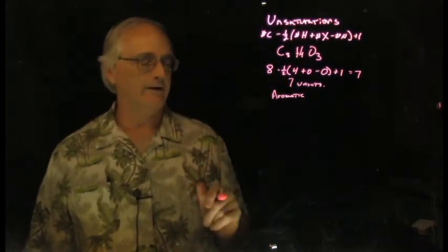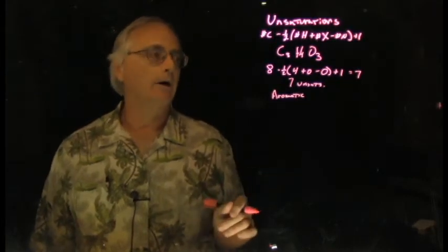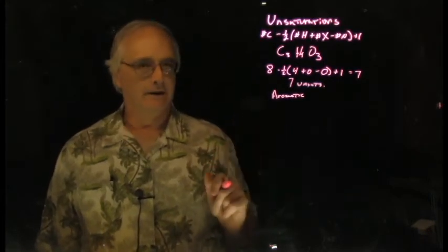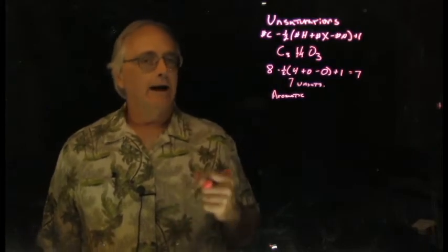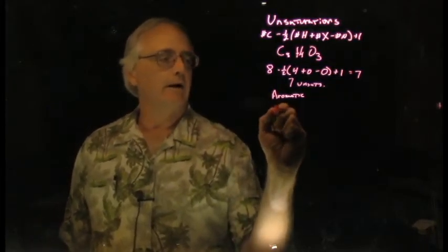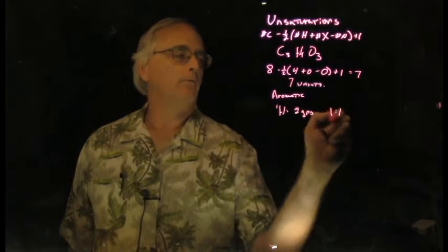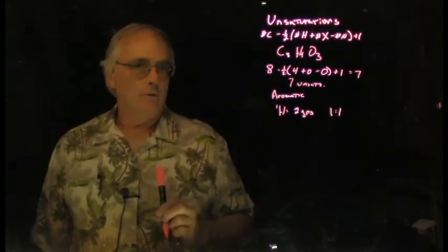There's more than just a benzene ring in there. That gives us 4 unsaturations. There's 3 more to go. So more double bonds or rings and other things like that in this molecule. Now we look at the groups and integrations. We look at the hydrogen spectrum for a moment, and what we see there are, for the hydrogens, only 2 groups. And they integrate 1 to 1.